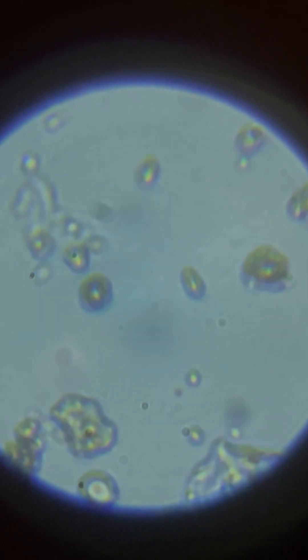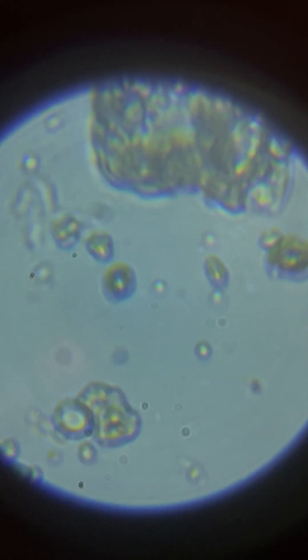Whoa, whoa, whoa! This is weird. Look at them crawl, guys — oh my gosh, they're alive! That's in your vacuum cleaner. They're moving, they're alive! Look at them, look at them live their life — they're so happy. They love dirt, what more could you ask for? Look at them. They're beautiful. Let's give them a little lens change, let's see if they look a little bit different.